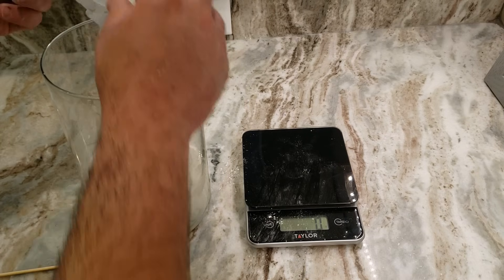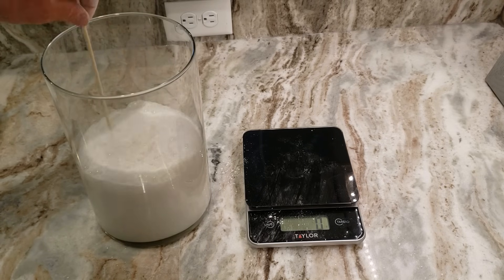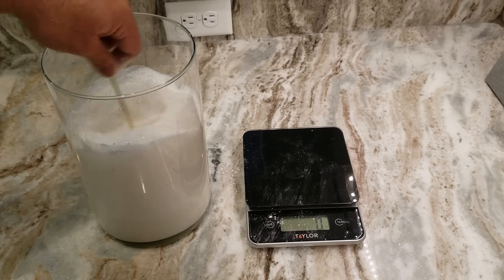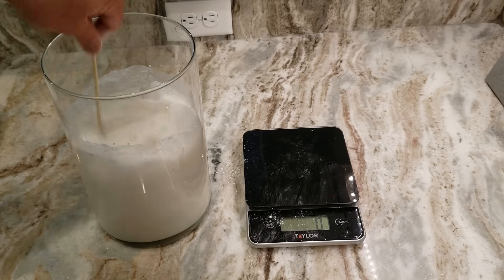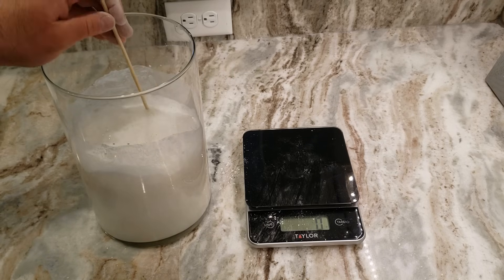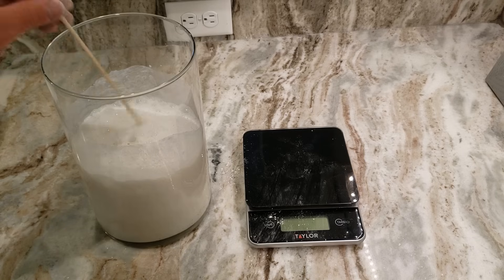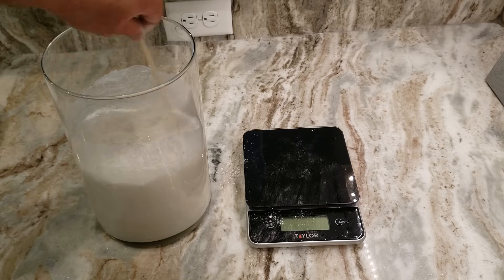We're going to add this in now. You can immediately see why I picked this tall container — it is bubbling pretty vigorously. That is the acetic acid in the vinegar reacting with the calcium carbonate to form our calcium acetate, which is really what we want. You can see it's pretty milky, which means we did have a lot of other stuff in there — there was probably some titanium dioxide that they put in the pills to keep it a bright white. So we're going to let this react and then settle out so that the other additives that don't react with the vinegar fall to the bottom and we can deal with just the calcium acetate.